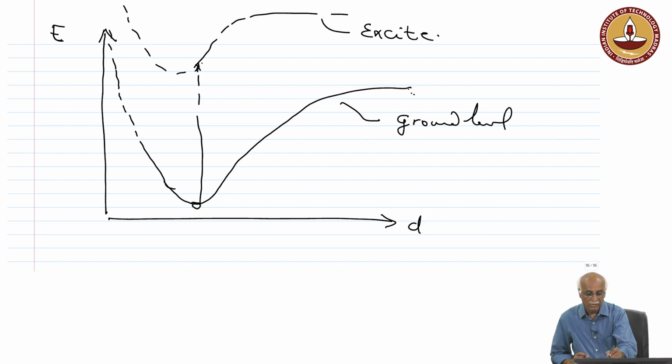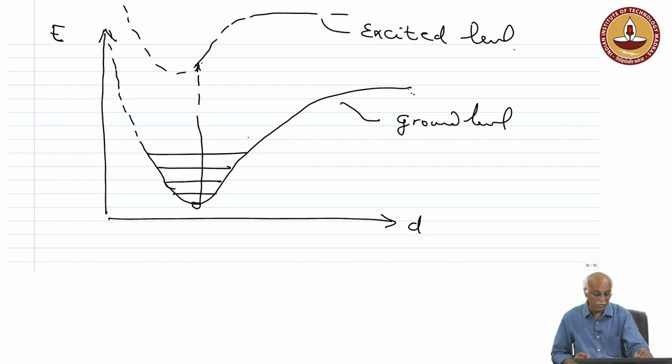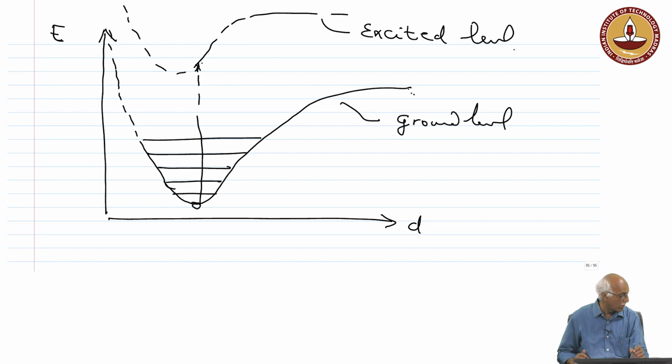Within the ground energy level, there will be some vibrational states. These are interatomic vibrational energy levels.